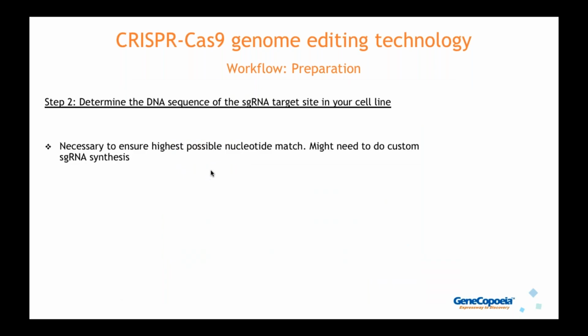Okay, so the next step that we recommend is to determine, and this is not essential, but we recommend determining the DNA sequence of the single guide RNA target site in your cell line.